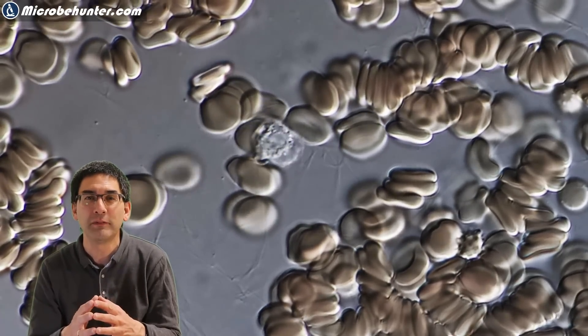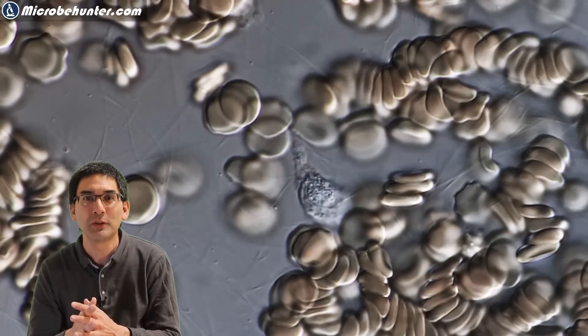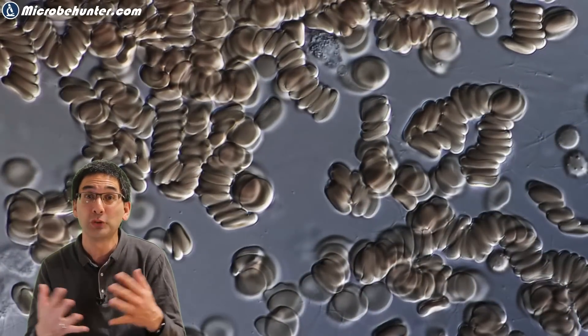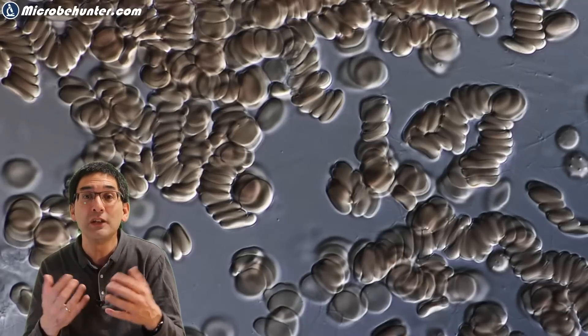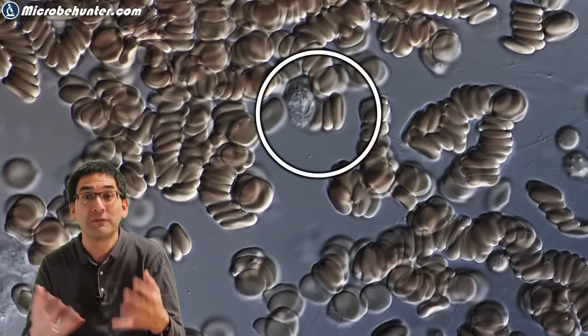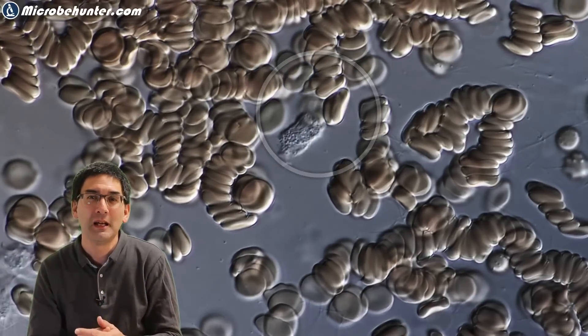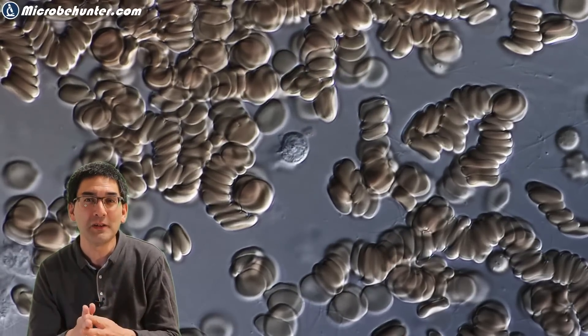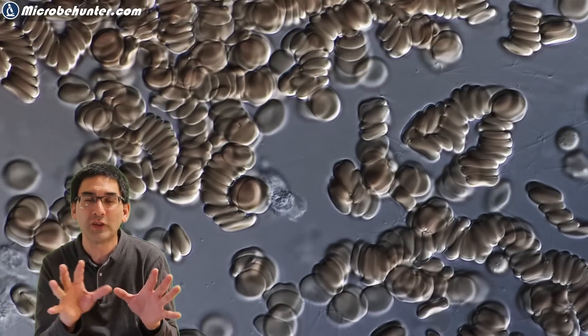They almost look stationary. In many of these video clips I had to film them for approximately 20 to 30 minutes to be able to actually see their movement by making them appear much faster, around 20 times, in my video editing program. I really wanted to see them move into different directions, searching the area for pathogens or bacteria.